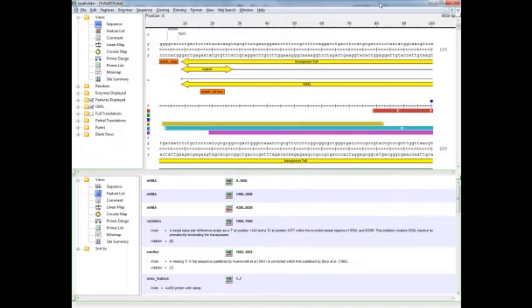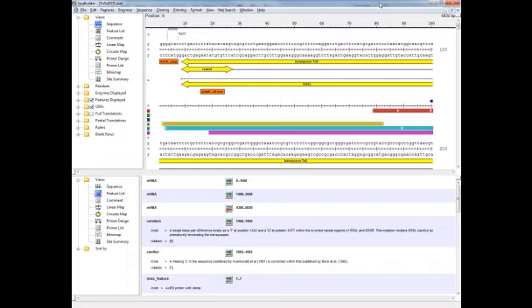You can control whether you want to display the panes horizontally, as I have here, or you can show them vertically, side by side.